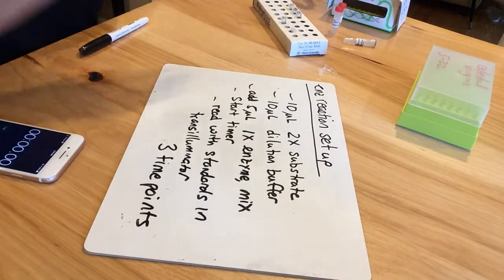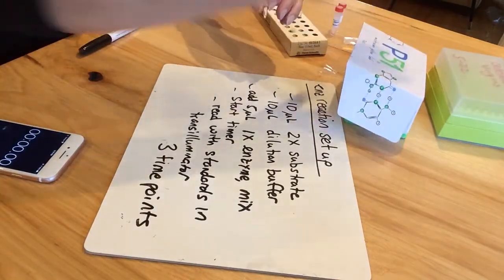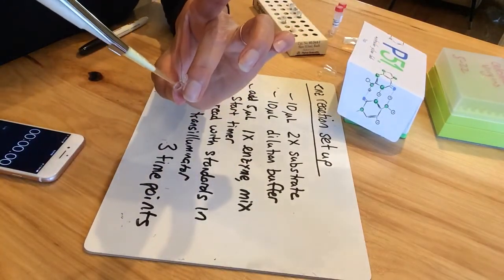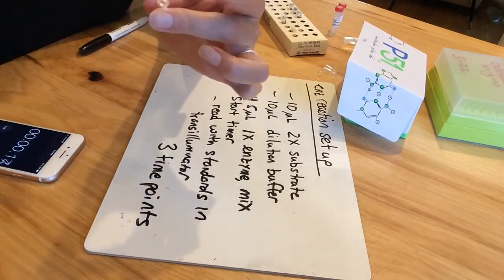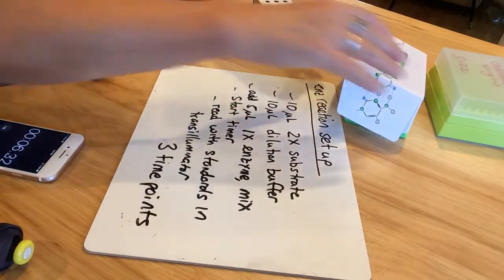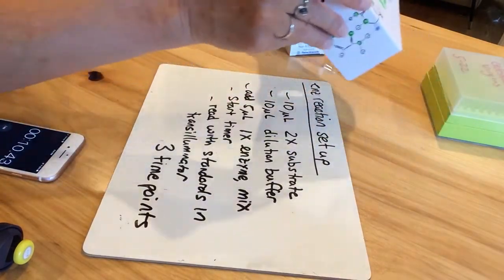And I'm going to get my viewer ready. It's ready to go. I'm going to put my enzyme in the reaction, but I'm going to go ahead and pipette up and down to mix it, close it, start. Okay, so it's reacting. You can't see the fluorescent molecule in there, but if you put it in here, you'll be able to see it.